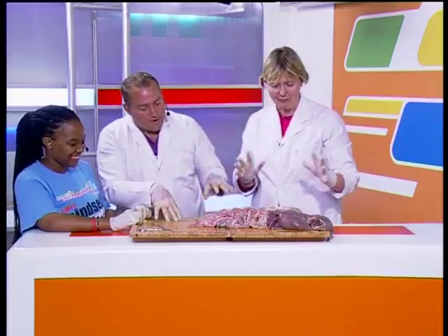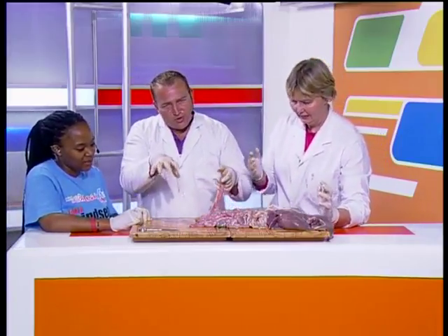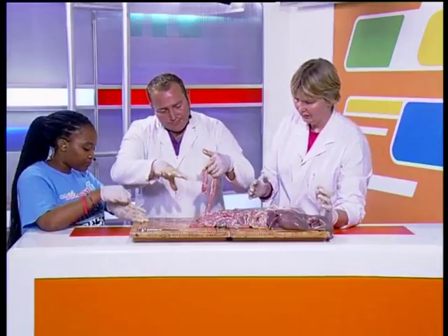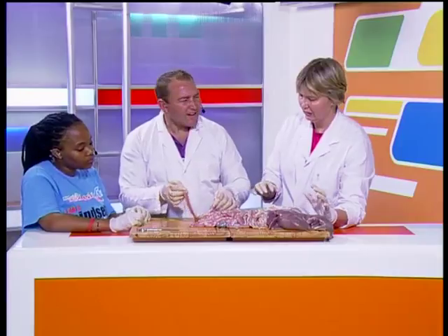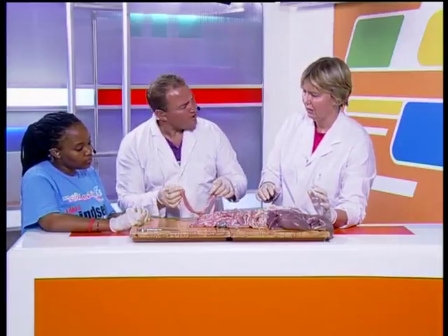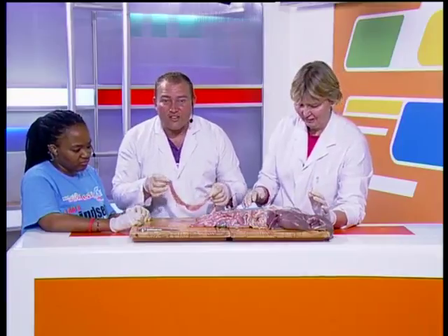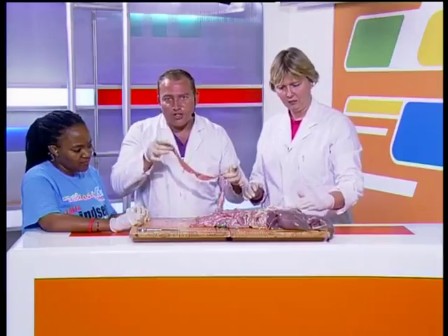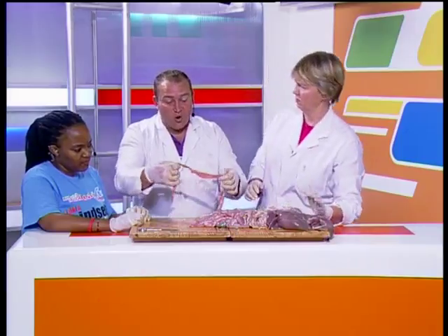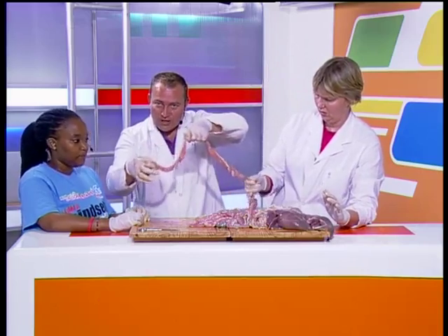Now remember, I said to you guys that when it comes to this whole digestive system, I told you that the blue whale had, I think it was how much? 5 or 6 kilometers. Yeah, it was kilometers of the large intestine, which is the smaller one out of the two. I want to just show you. Now watch this. This is called the what? Small intestine. This is a small intestine. We'll cut it, but I want you to have a look.